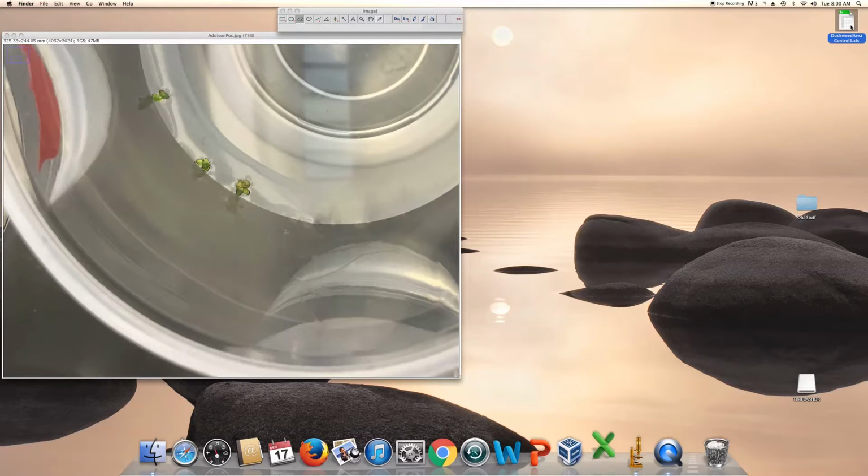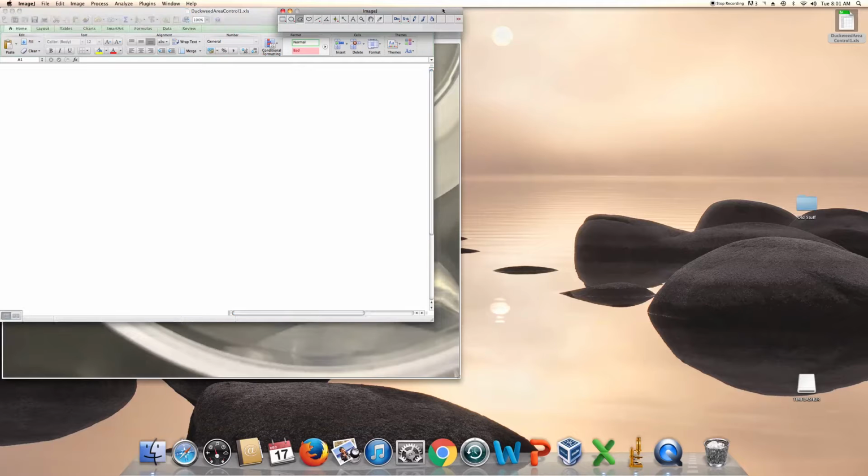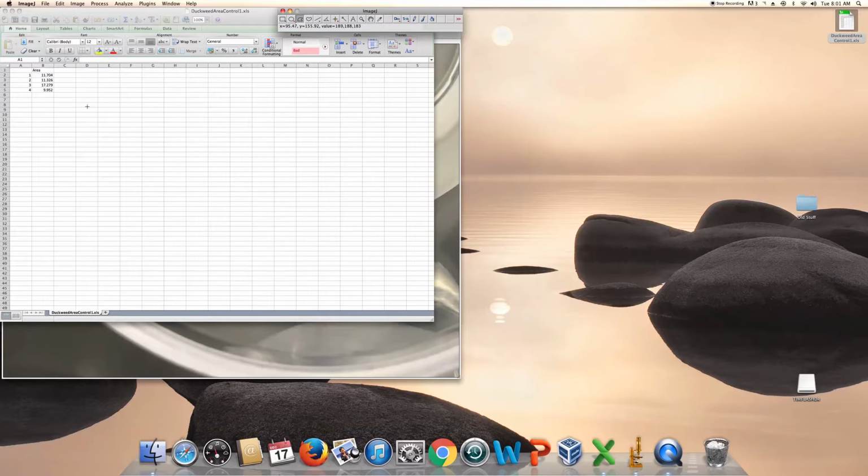And so it will actually save your Excel file data for you. So that does save you a little bit of time, but note that what it's doing is just saving it exactly like we saw it the first time. It's not adding a column saying this is your control. It's not adding what ID it is. That's why I typed it in the Excel file title. I would just suggest writing it down and coding it yourself in R, but it is always possible to do it this way. So there's your area.